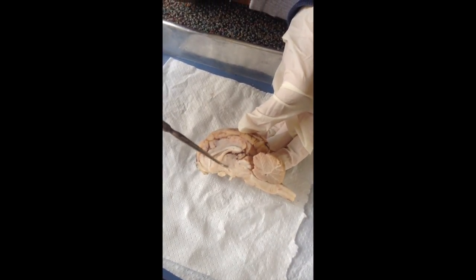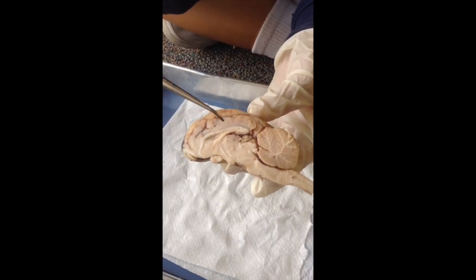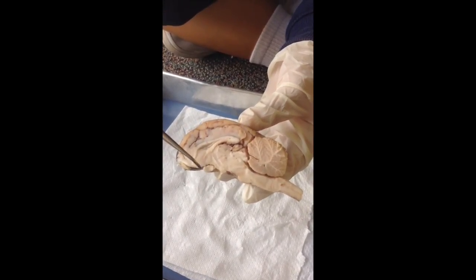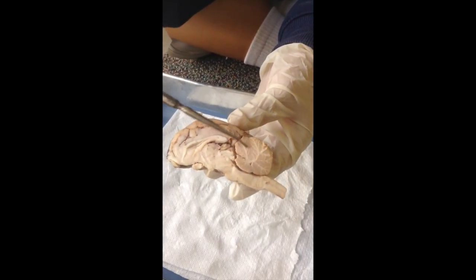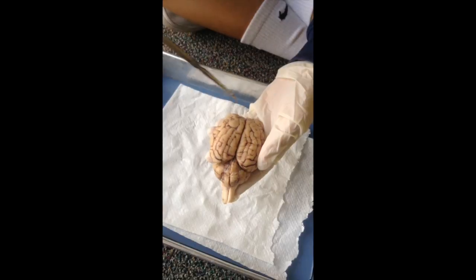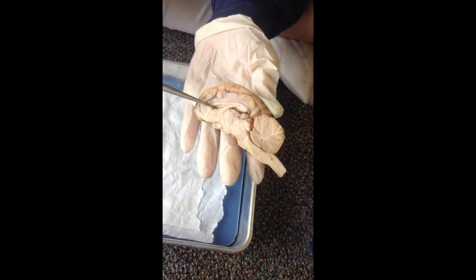Hypothalamus. Pineal gland. It's the little, yeah. Mammillary body. Optic chiasma. Arbor vitae. The fourth ventricle. Longitudinal fissure. Lateral ventricle.